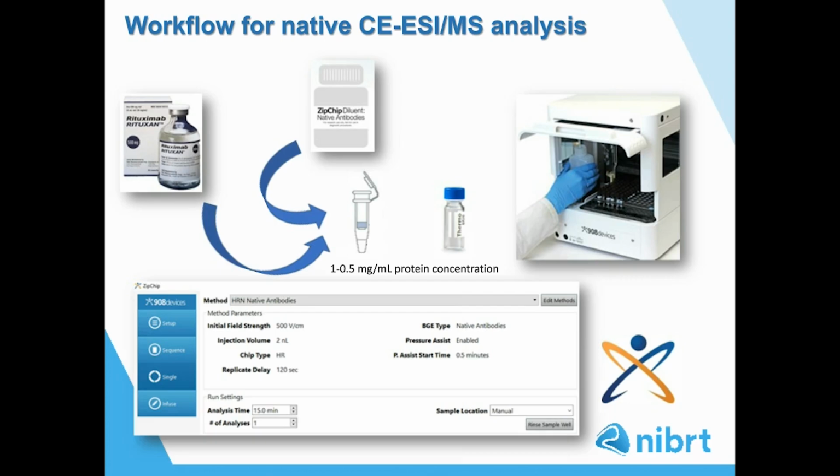As I said before, some settings need to be adjusted, such as sample load and the CE separation. And you can see them in the slide here in the screenshot of the software, where we were using basically a default method that already comes with the software for native antibody analysis.